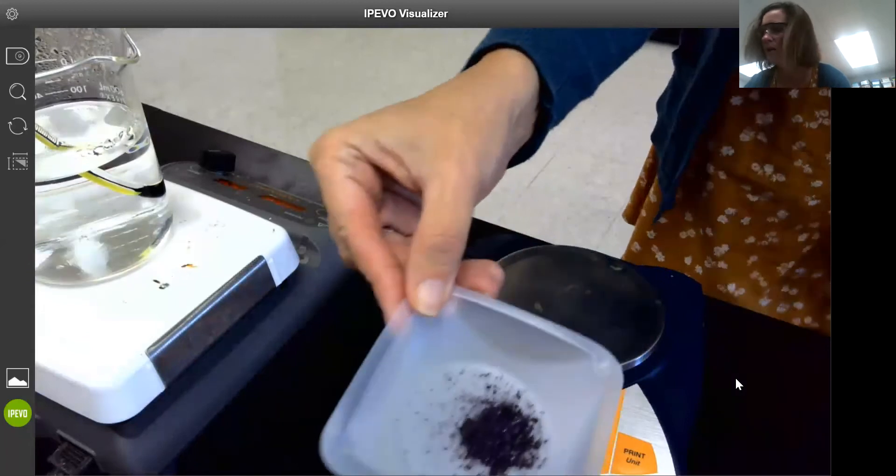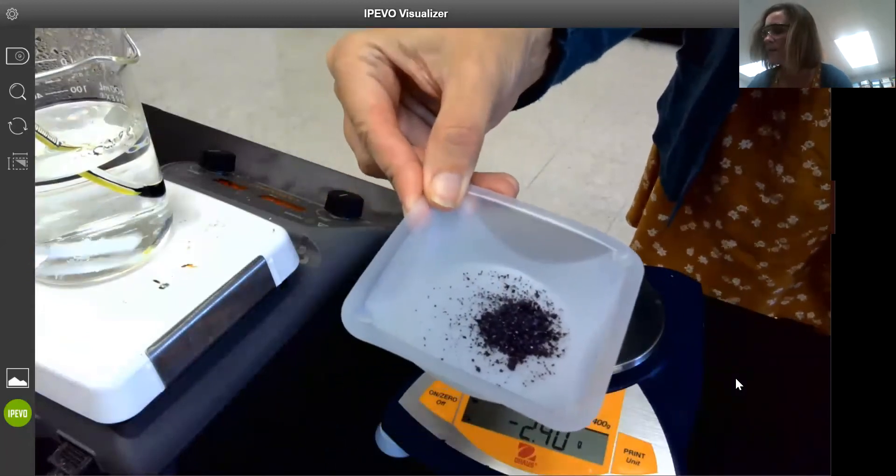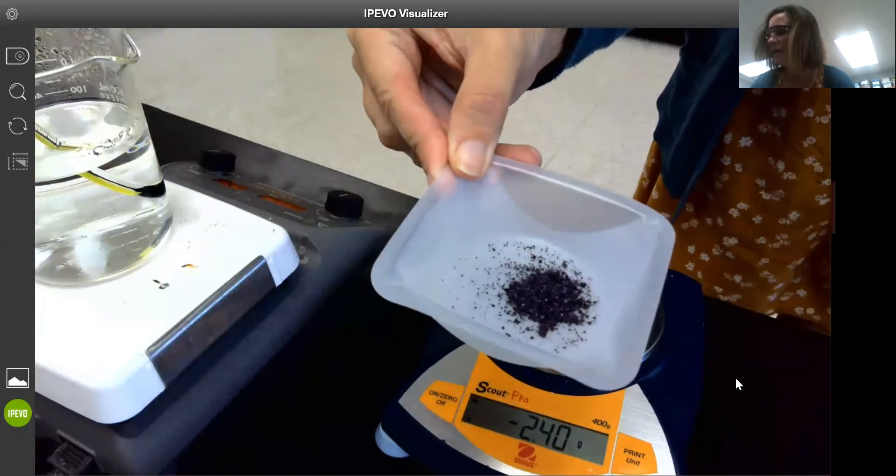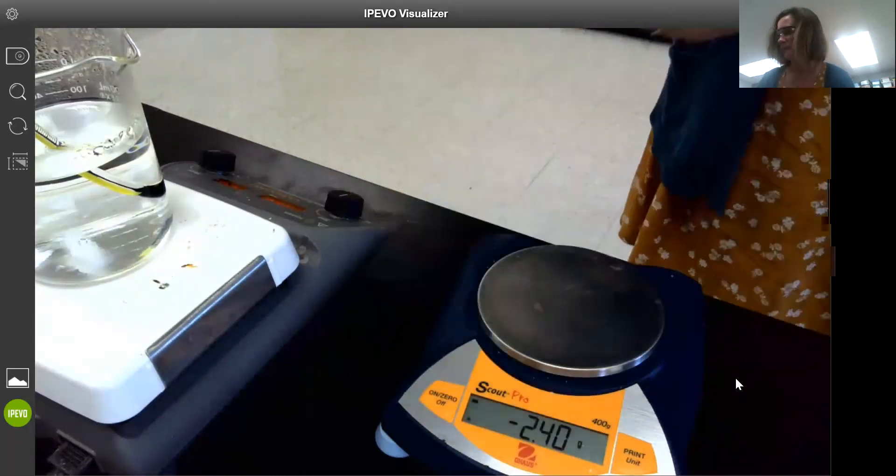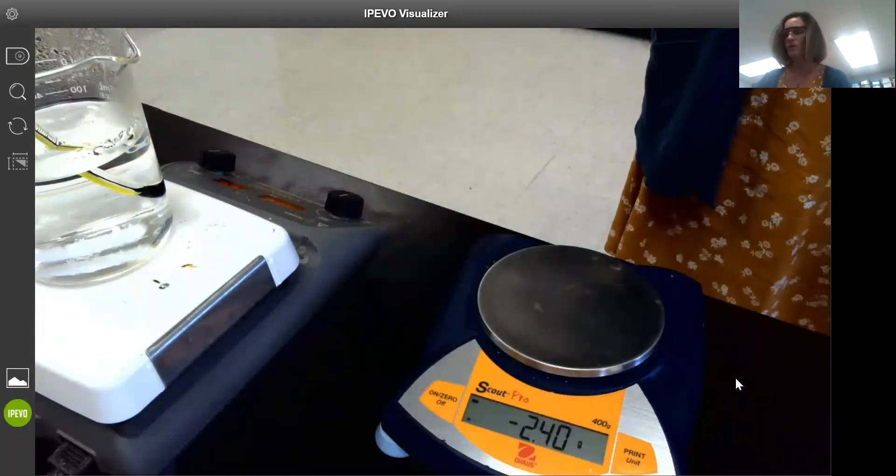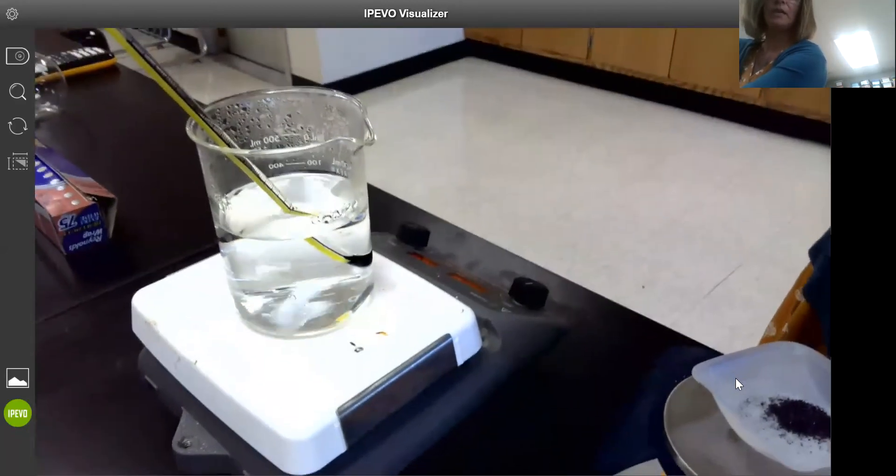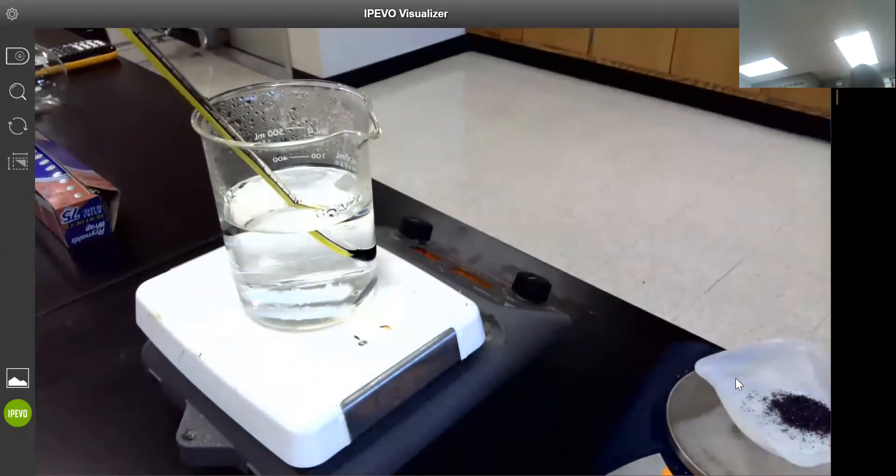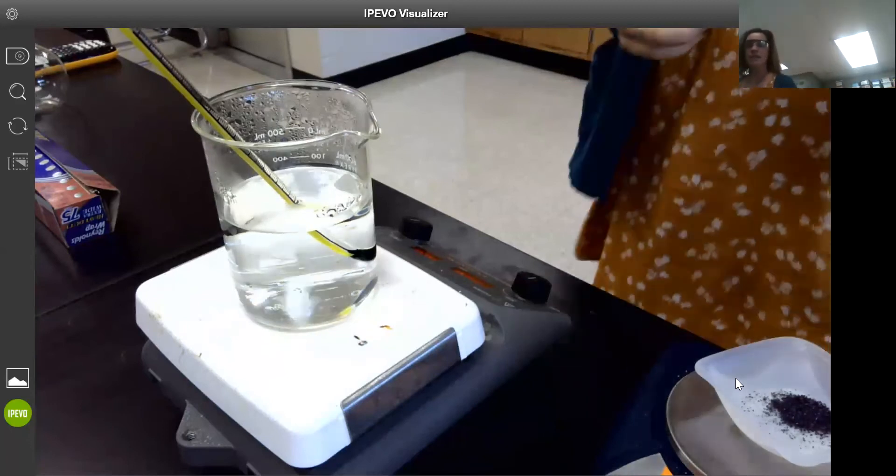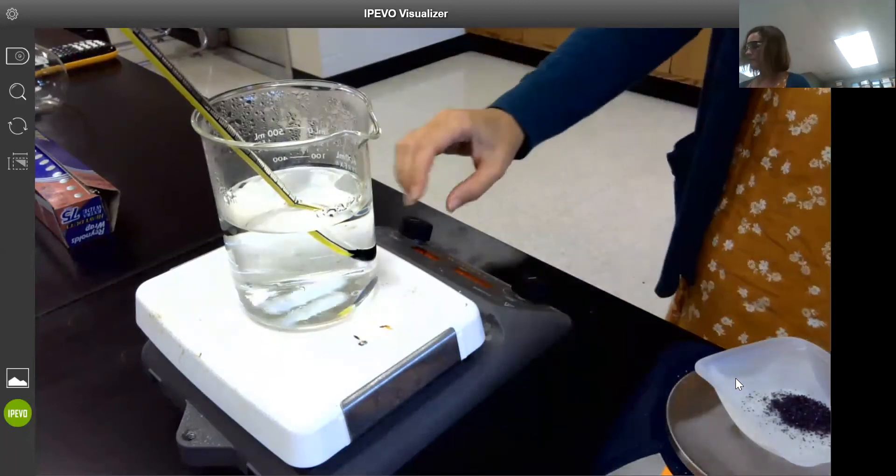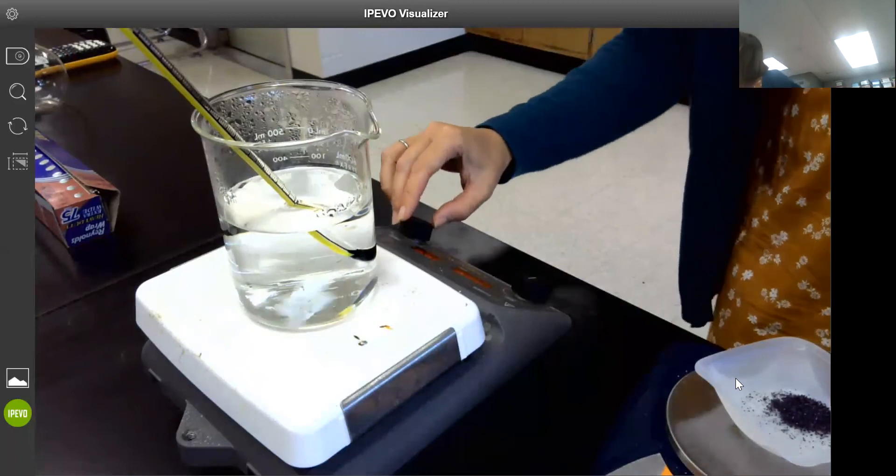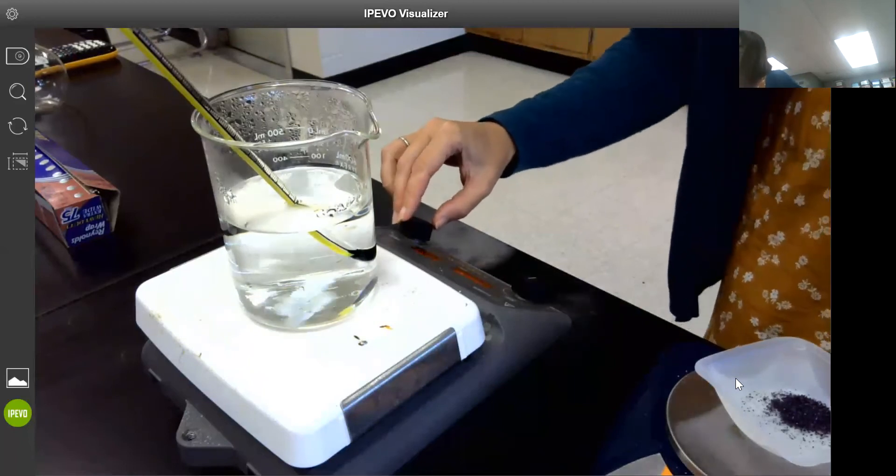I'm going to add this now to a beaker of warm water. Inside this beaker I already have about 400 milliliters of water heating up right now. The temperature is about 75 degrees.